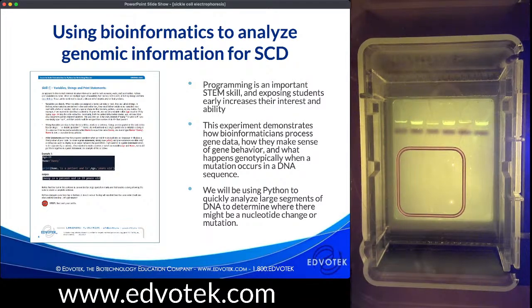And so this experiment is going to walk you and your students through what it takes to create and search a database using DNA sequence data from the HBB gene. This exercise demonstrates how bioinformaticians process gene data, how they make sense of gene behavior, and what happens genotypically when a mutation occurs in a DNA sequence. We'll be using Python to quickly analyze large segments of DNA to determine where there might be a nucleotide change.